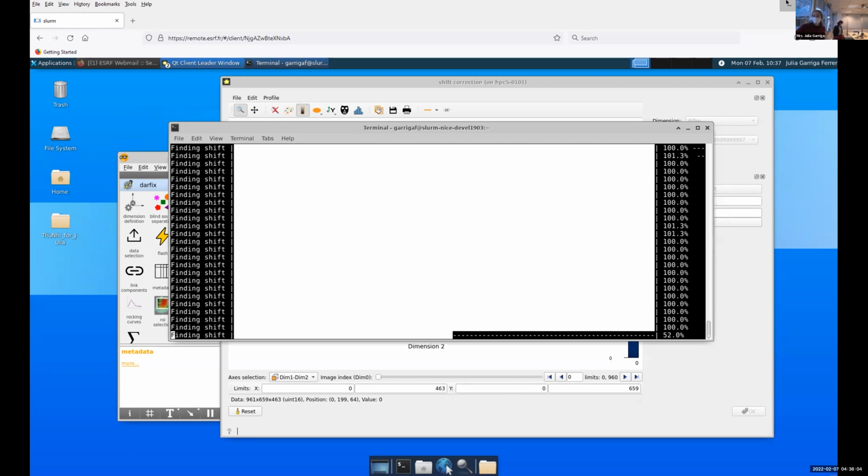Okay, I guess some of you, or maybe all of you, weren't able to connect to Learn because Gabriel just told us that they encountered problems with their file server and the automatic creation of their accounts failed. Now the problem is fixed, so could you please try to log in again to Guacamole? If it works, you will have this same data set available to test. The data sets that we sent don't have the same dimension as this one, so it's a smaller data set. The scan is actually the same, but the stack is smaller, and the output won't be correct because some of the images are missing. It's good enough to test the widgets, but you won't see the same result as we do, which might be confusing.